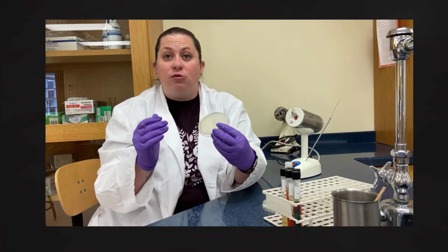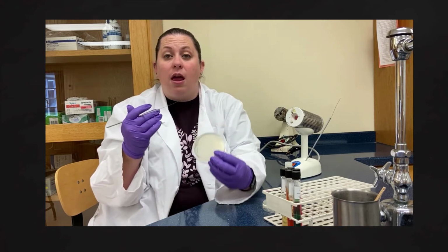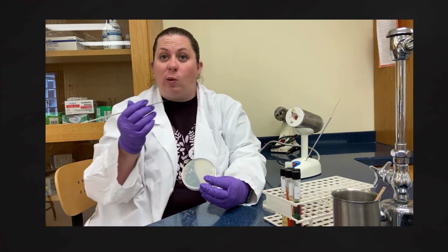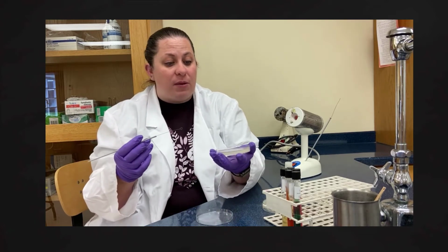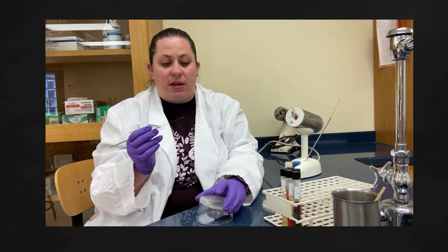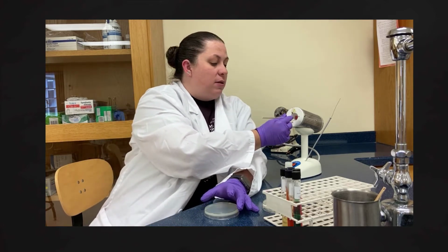Now I want to make sure that I don't draw into any of the other 3 areas that I've already pulled, in the sense of going back into it. We want to enter into 3, pull it into 4, but we don't want any of our streaks to go from 4 into 2 or 1. We want to make sure that we are separating those. And so I'm going to come over from 3, and I'm going to go back and forth into the space that's available. And so that's my inoculation there with my streak plate.